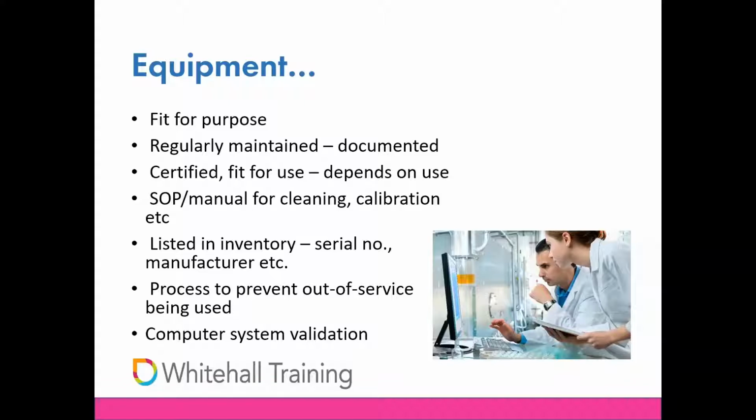Use of equipment inventories is really helpful. And these should include things like serial numbers, location of the equipment, the manufacturer, service frequency, provider, related standard operating procedures, and also who is responsible for the maintenance of that equipment.